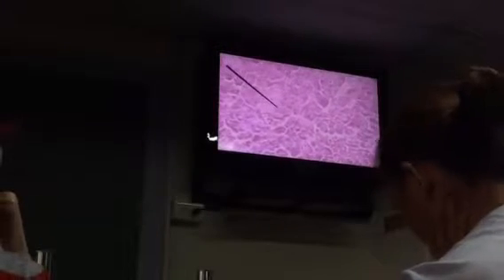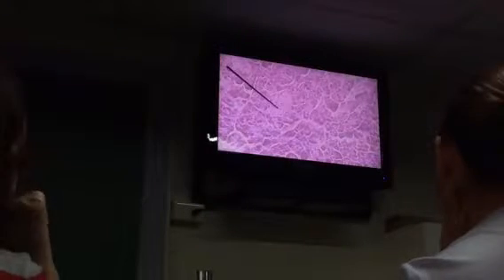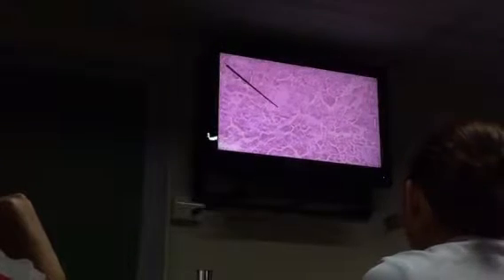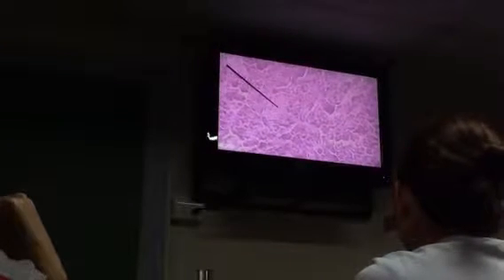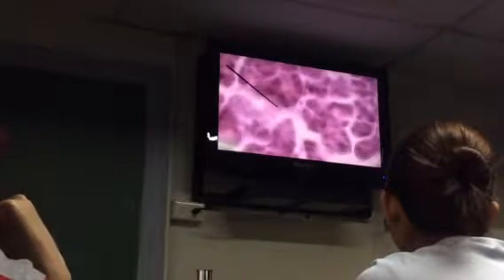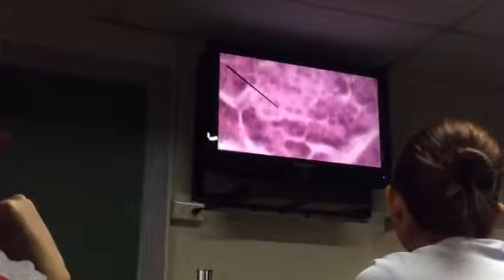Now, the islets, on the other hand, are described as being made up of masses of cells. There you go, like this one here. You can identify them a little by the staining. If you look closely, they are stained paler in contrast to the acinar cells. And then again, if you look at this under high power, you will see that this is made up of a group of cells, in contrast to your acinus. And look at this, that will be your islet.